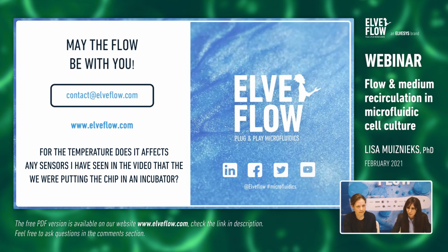We leave the tiny tubing that reaches the chip passing through the incubator, so you can close it with the lid, because the OB1, the flow sensors and the valve have electronics inside, so they have to stay outside the incubator. That is the answer.